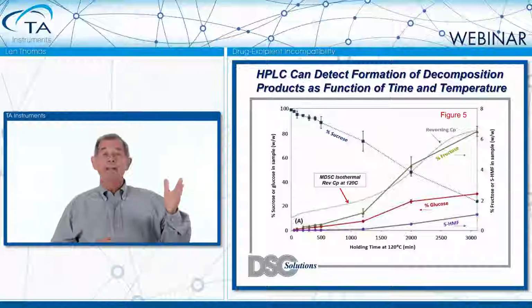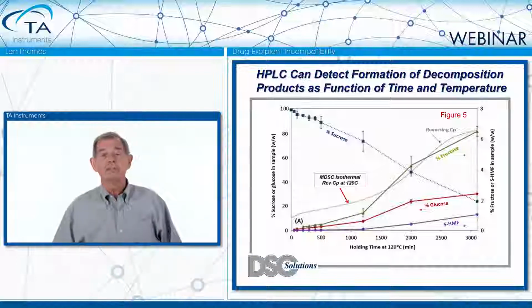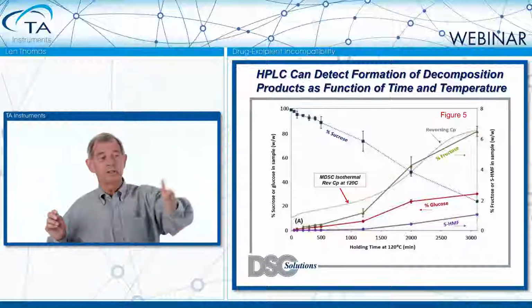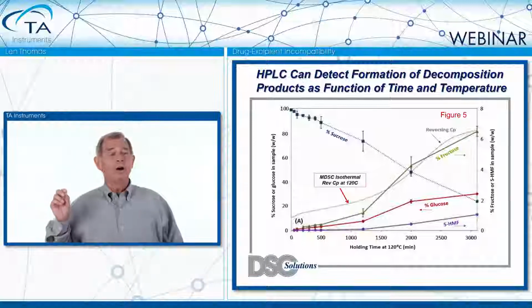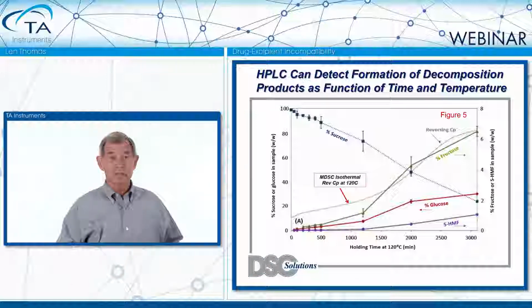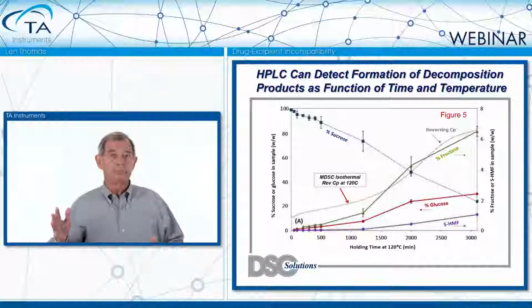Now, you know what % conversion takes place versus time at that temperature. And so what you can do is, as they did here, and you can see the values indicated, pull samples at that particular point in time, take them, put them in the refrigerator to stop the reaction. So when you have all of your samples built up from different time periods, then you can go ahead and do your chemical analysis.